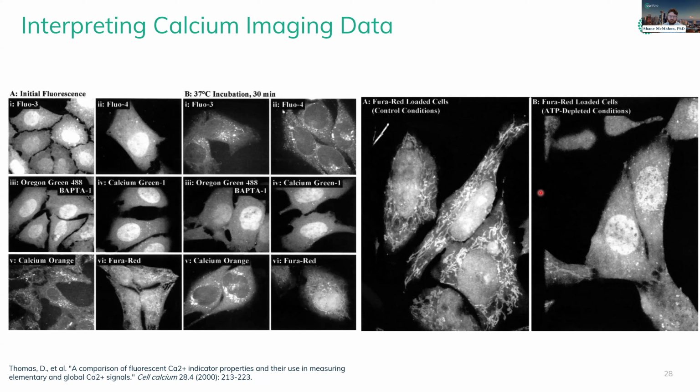However, these measurements are very difficult to make. So to illustrate this, I want to take a quick look at this figure from the Thomas et al. paper from 2000, where they evaluated several different calcium dyes in HeLa cells.